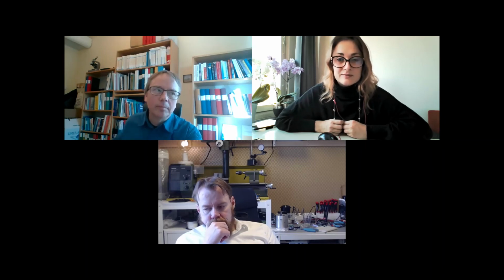So Börje, I wanted to ask your opinion. I see this approach as very feasible and very suitable for paper and packaging, right? So do you have maybe some industrial application cases or some experience? If you would put it in simple words, in one sentence, in which case you would use XRF instead of other measurement techniques for the same quantification chemical purposes?